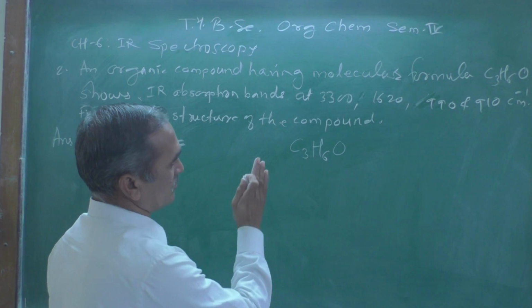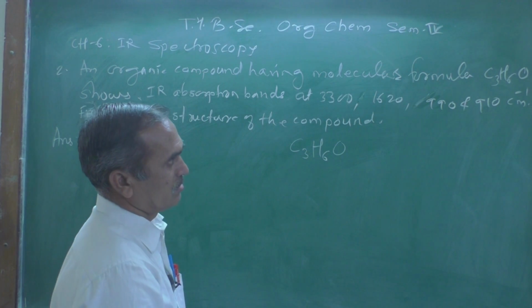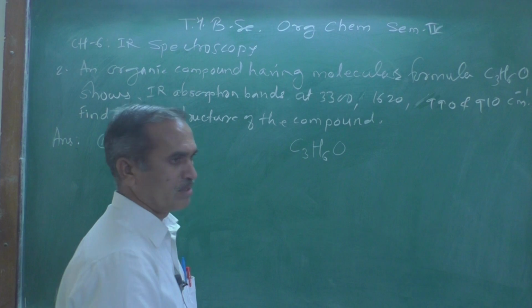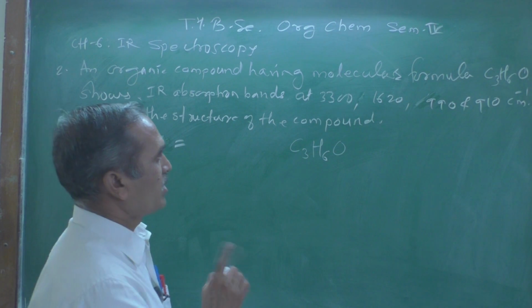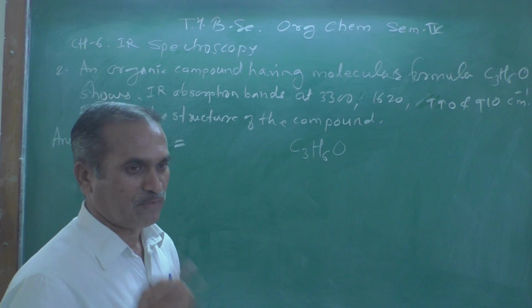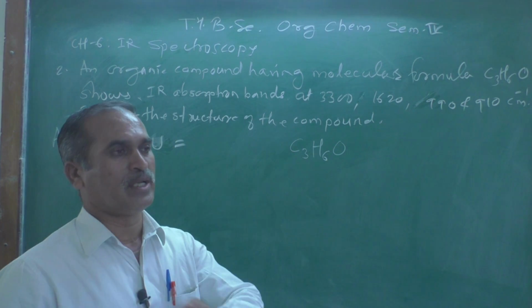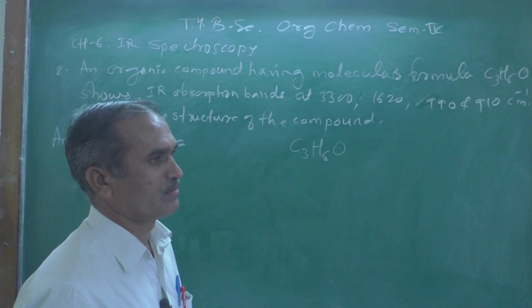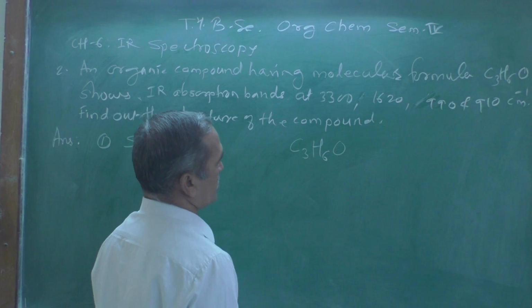Concentrate at the blackboard once you have understood this. So now what I am doing here, I am applying the first method, which is a commonly used method for the determination of sites of unsaturation.